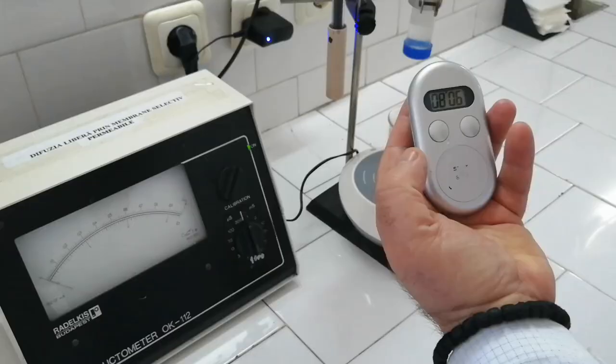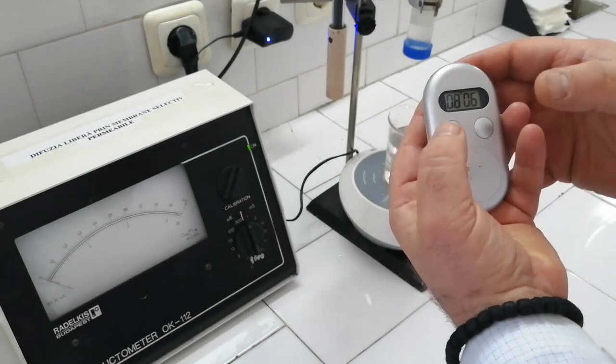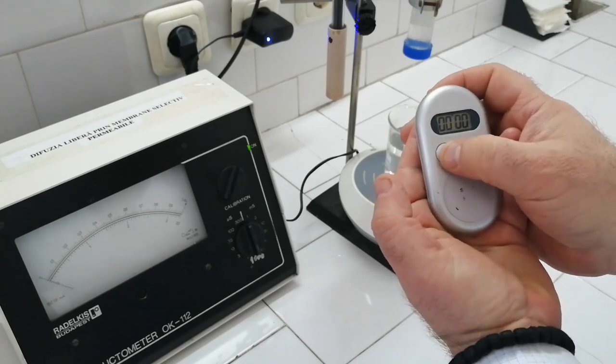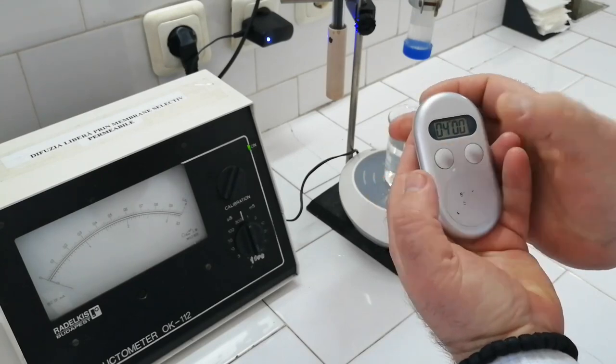Use the lab chronometer to measure the diffusion time. Reset the displayed value by pressing the two upper buttons at the same time. The same two buttons are used to set the values required for this experiment, which is 30 minutes. The chronometer works only in countdown mode and can be started using the large button.